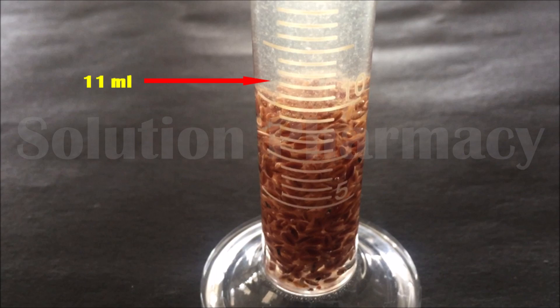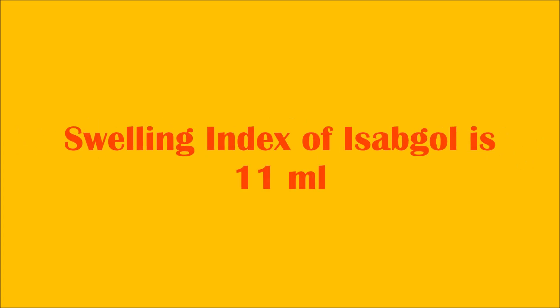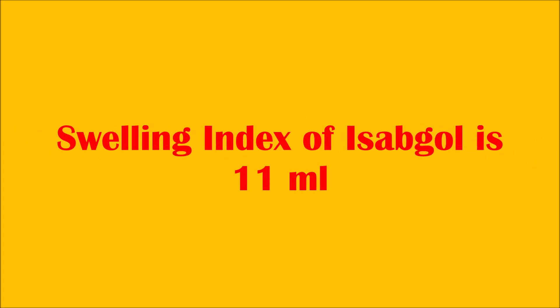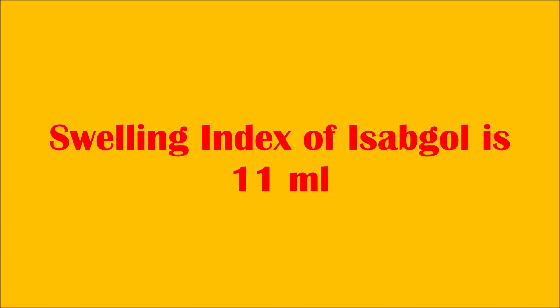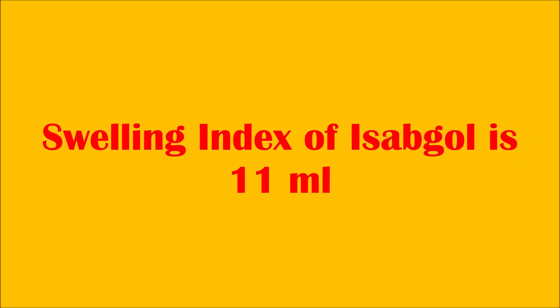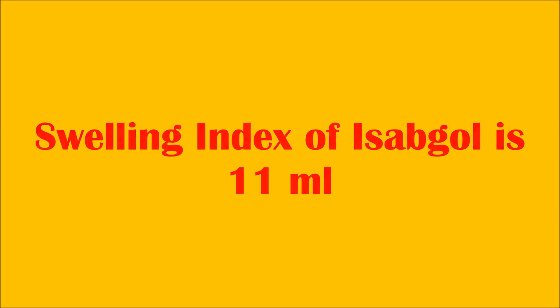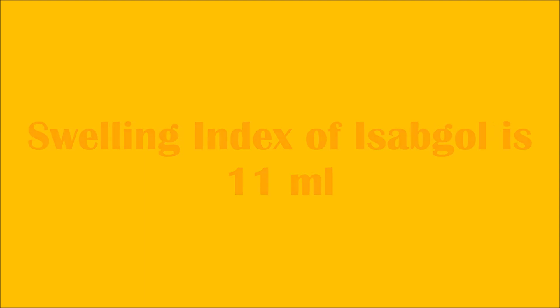Each division of the measuring cylinder is 0.5 ml. The volume occupied is 11 ml, which is within the standard value of the swelling index of isabgol — that is, 10 to 14 ml. In other words, the swelling index of isabgol should not be less than 10.